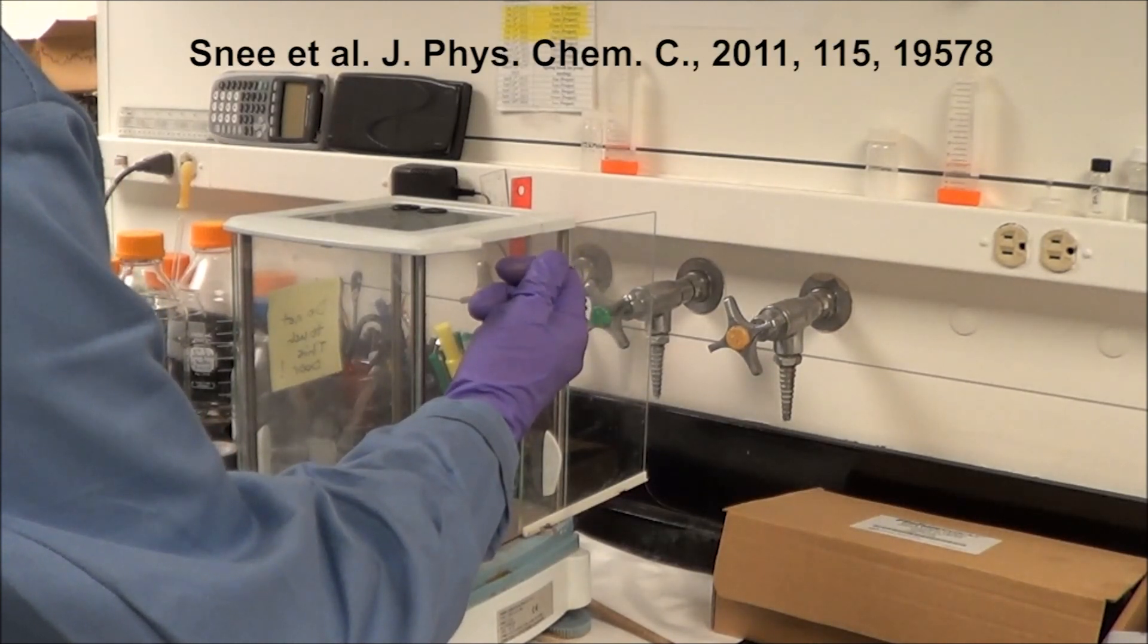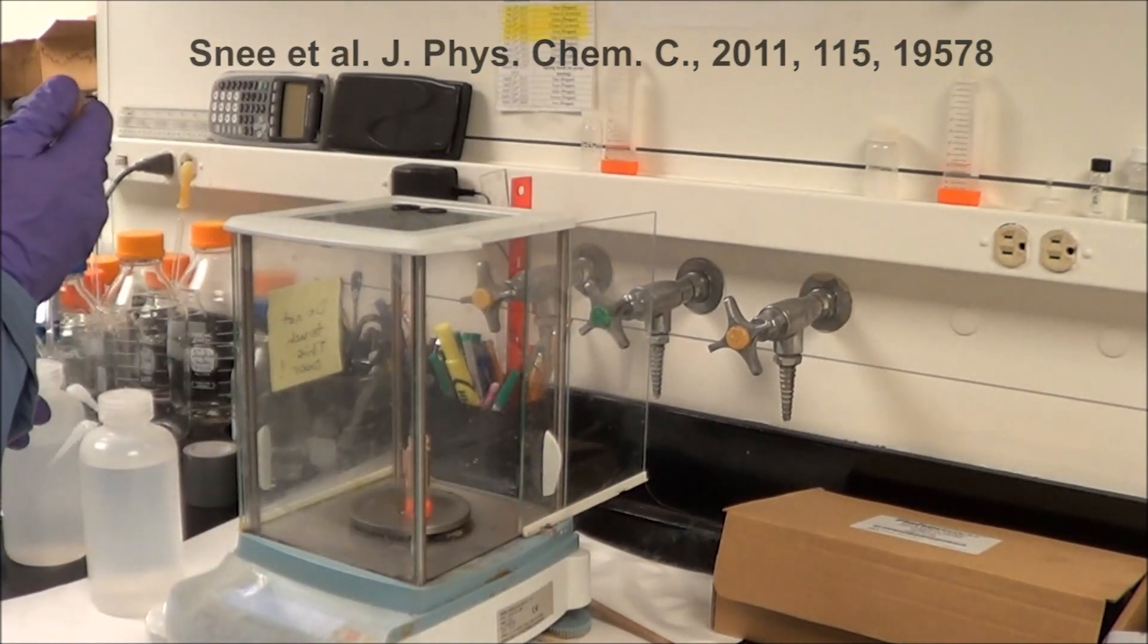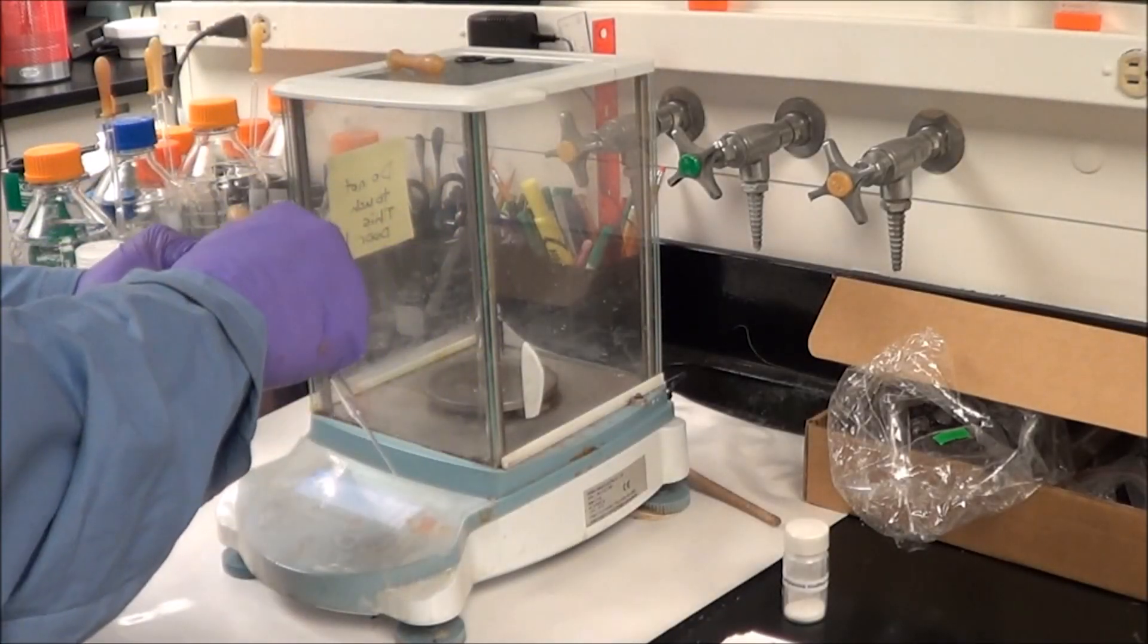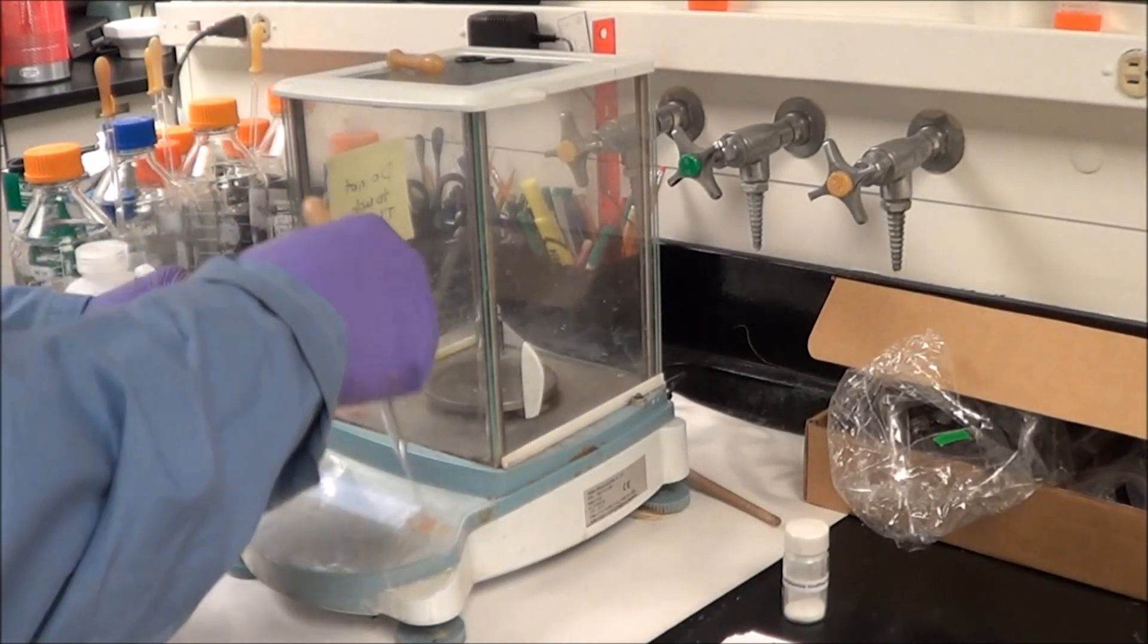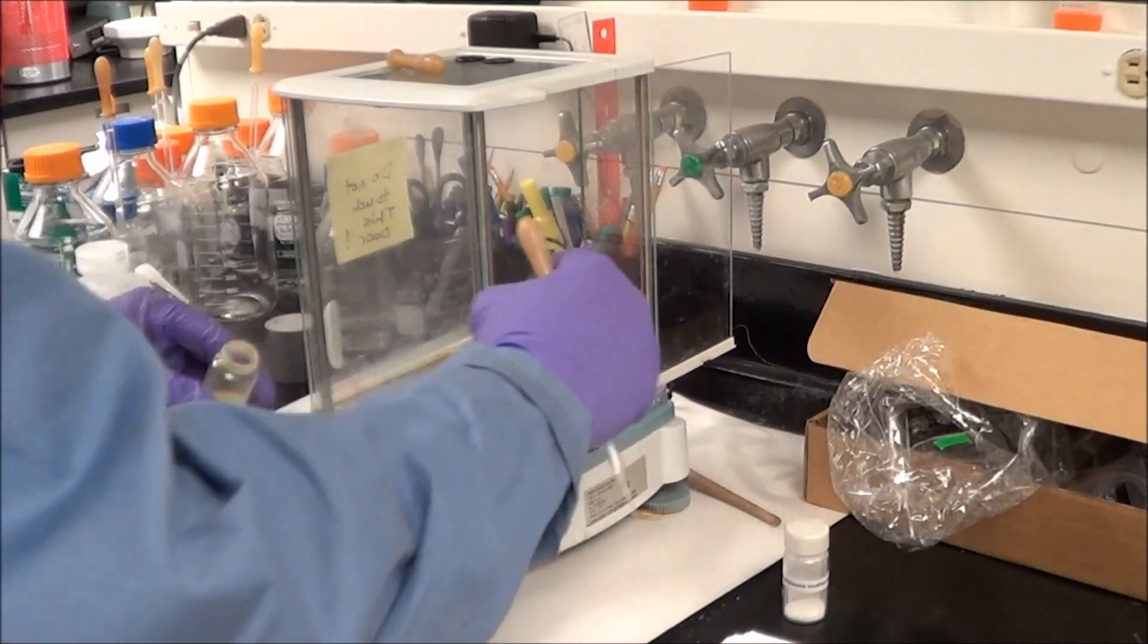We're starting out with cadmium selenide over coated with zinc sulfide quantum dots prepared according to the reference shown above. I am going to work with just half a gram of growth solution because I know how many quantum dots there are in every gram, and I don't like to try to water solubilize more than half a gram at once. It tends to hurt the phase transfer yields if I use too many dots at once.